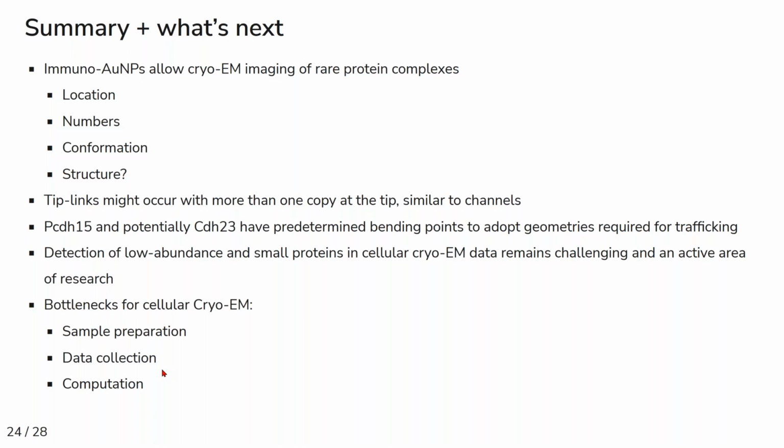And since time on a high-performance electron microscope is precious, it would be better if we could collect tomograms in a short amount of time. And there are some very interesting recent approaches that cut that time down to only a few minutes by keeping the camera on while you're tilting the sample.